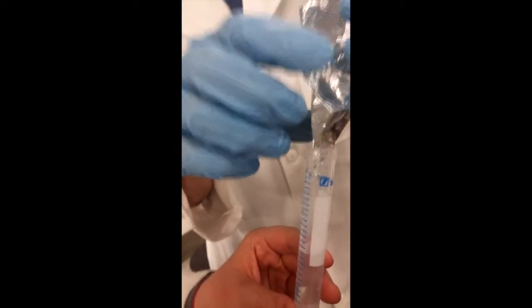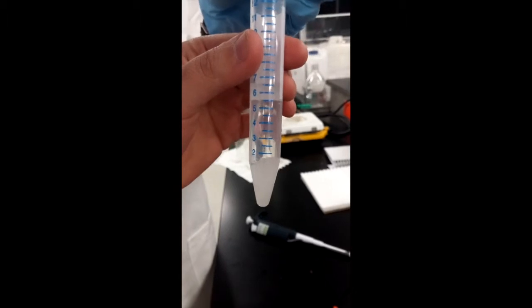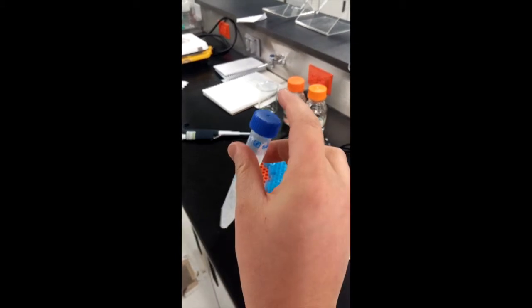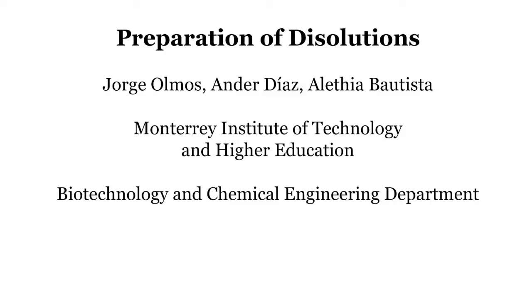To prepare solutions, you must consider the nature of the components, for example, when you mix glycerol, or solutions of acids, prepare them in an extraction hood. Also adjust the pH, properly read volumetric instruments, avoid precipitation by mixing or heating, remove heat from the mixture of compounds, label the solutions, sterilize solutions without thermolabile substances, consider the presentation of the substance like hydration, and follow special procedures or suggestions. To properly elaborate solutions, one must understand how to calculate the amount of the compounds and the procedure every solution requires to be correctly finished.